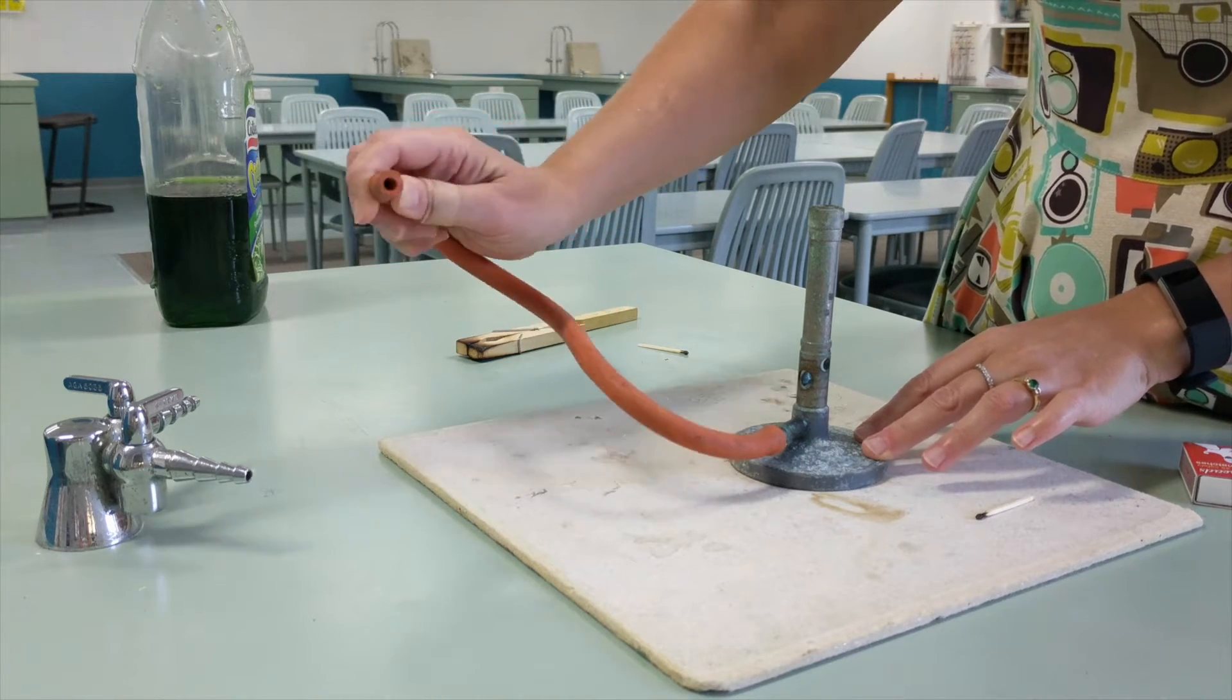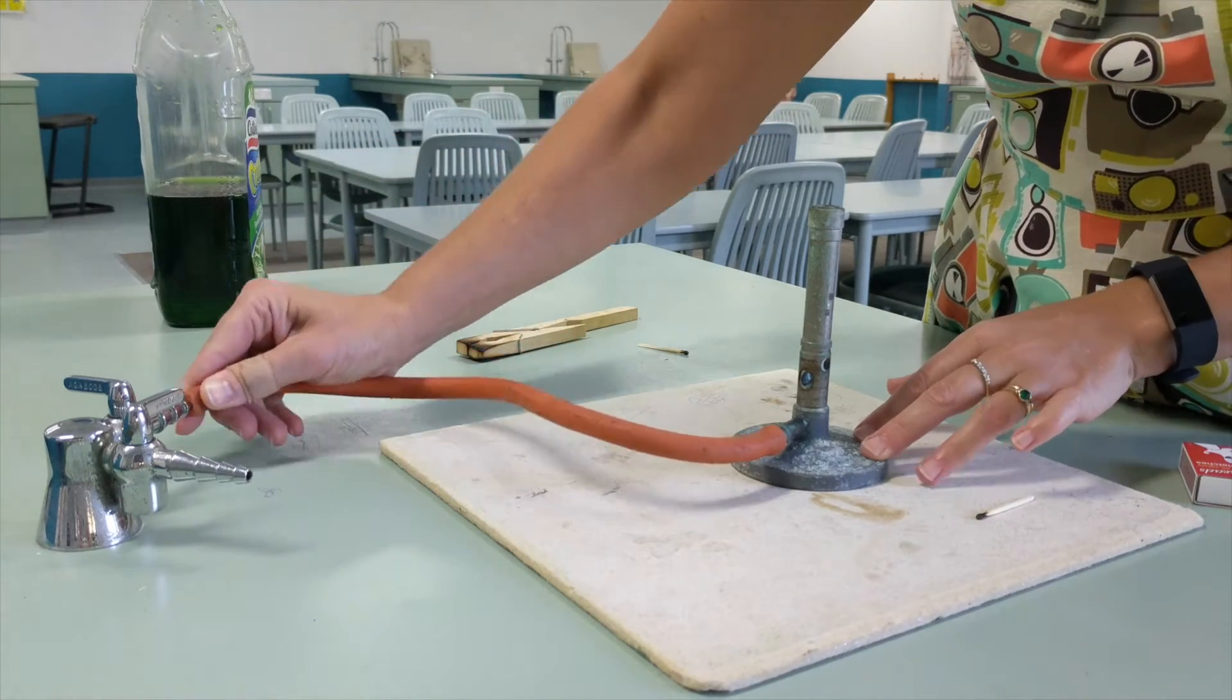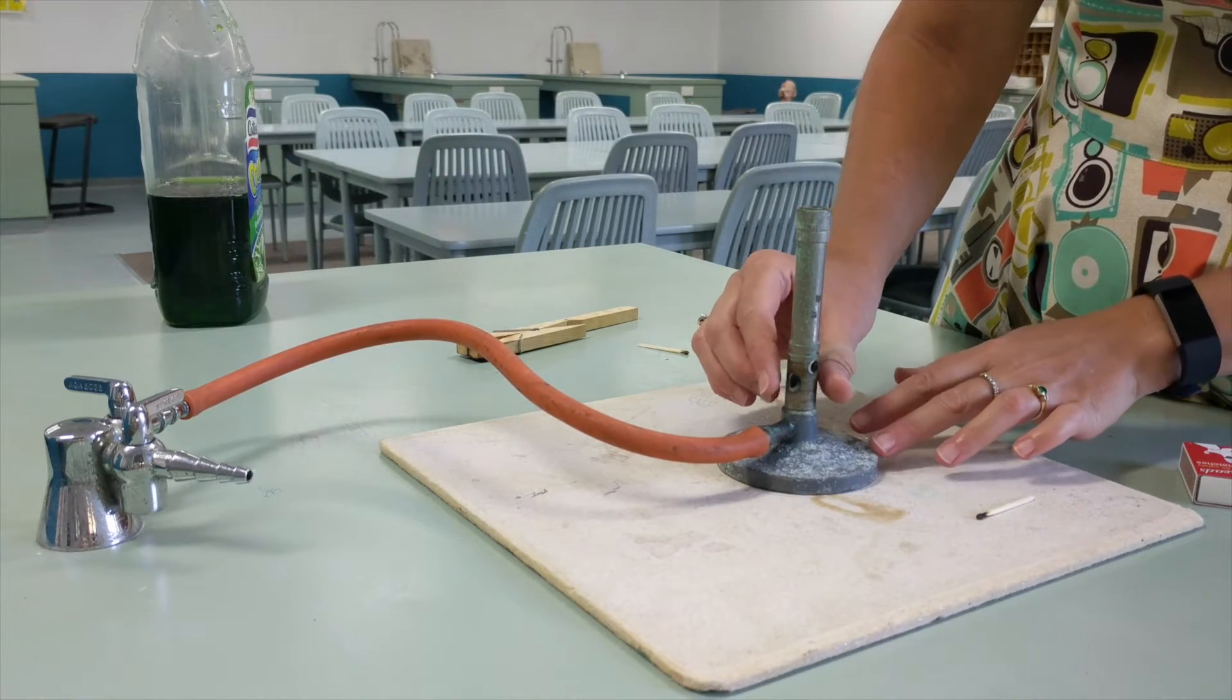First thing you do after making sure the hose is intact is plug it into the gas tap. Then you need to make sure the air hole is closed.